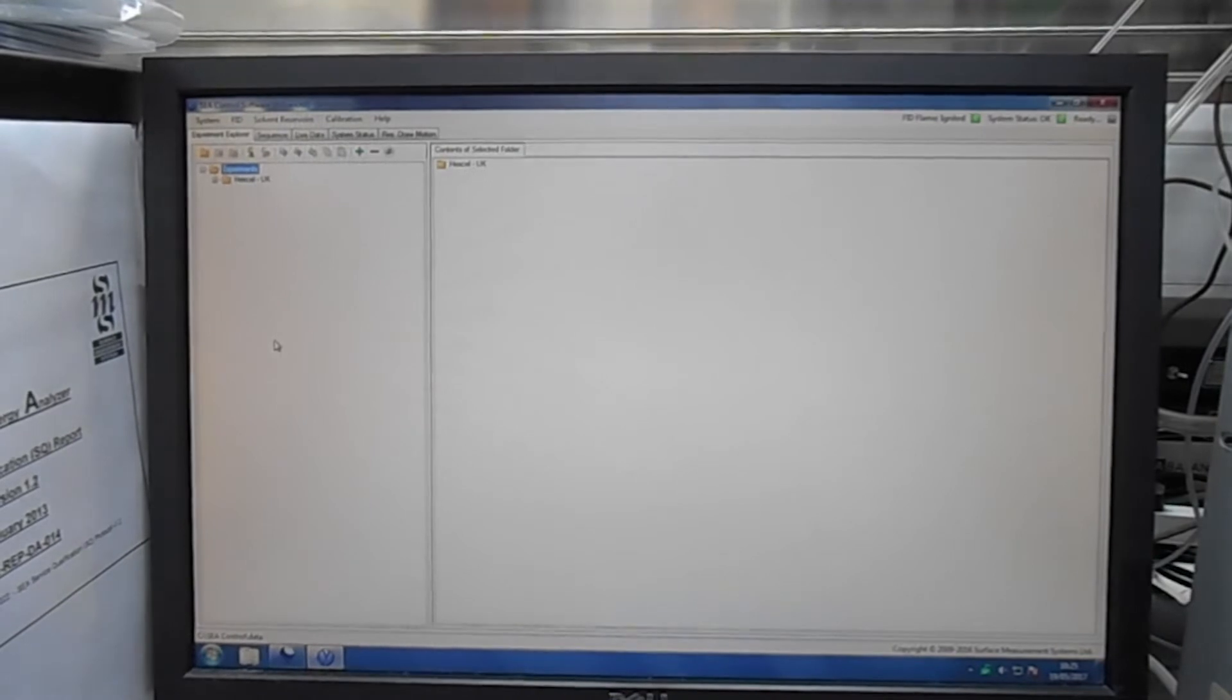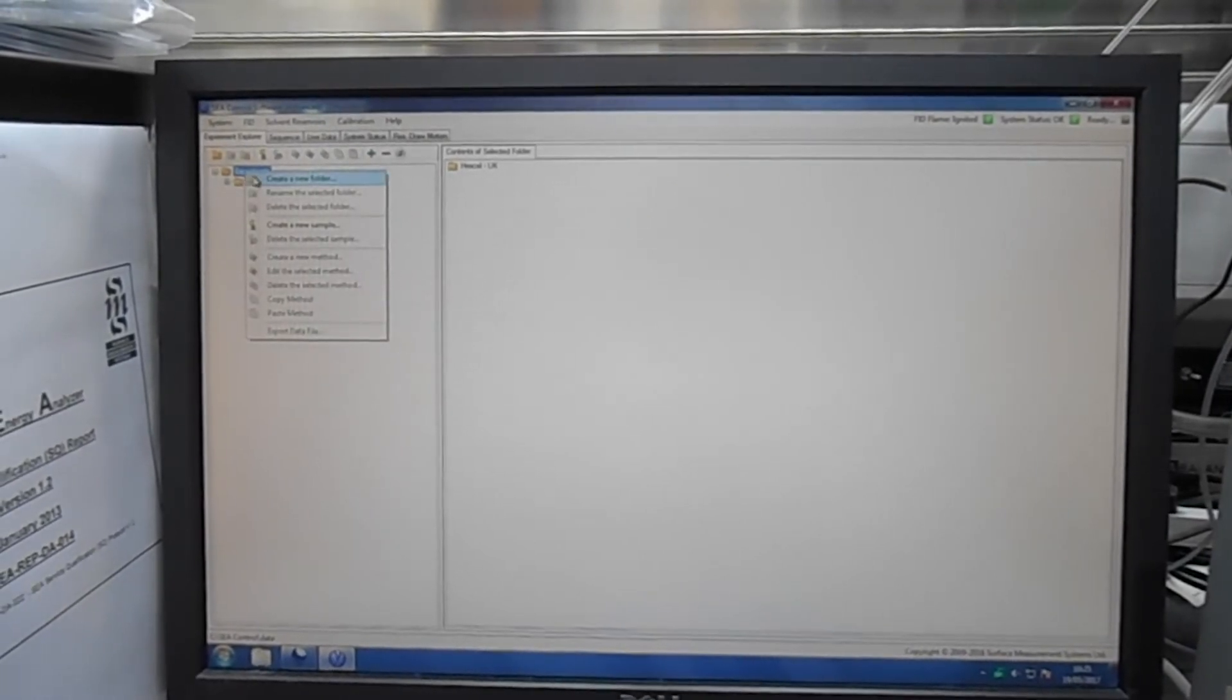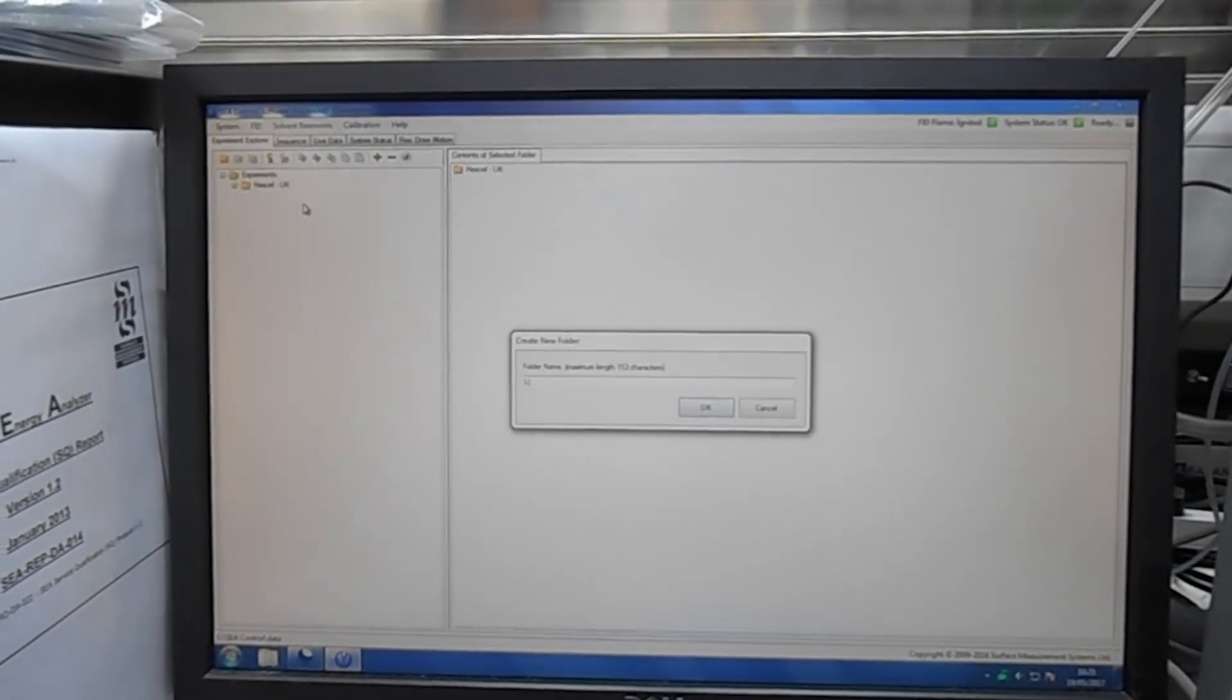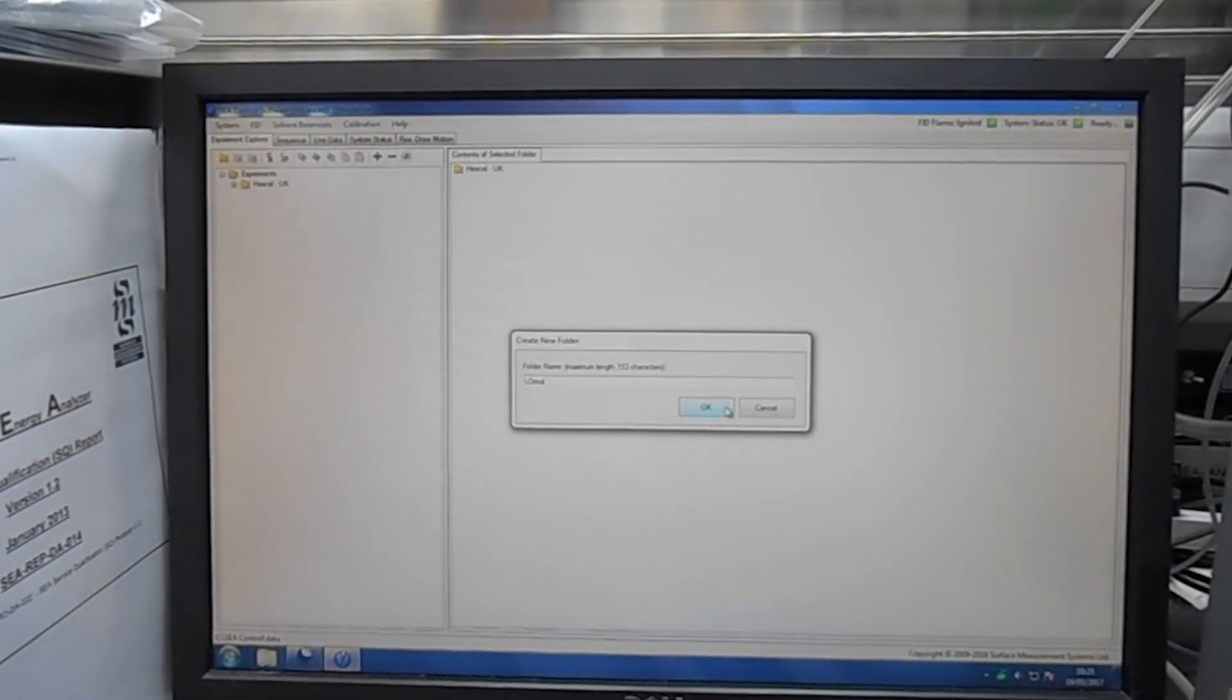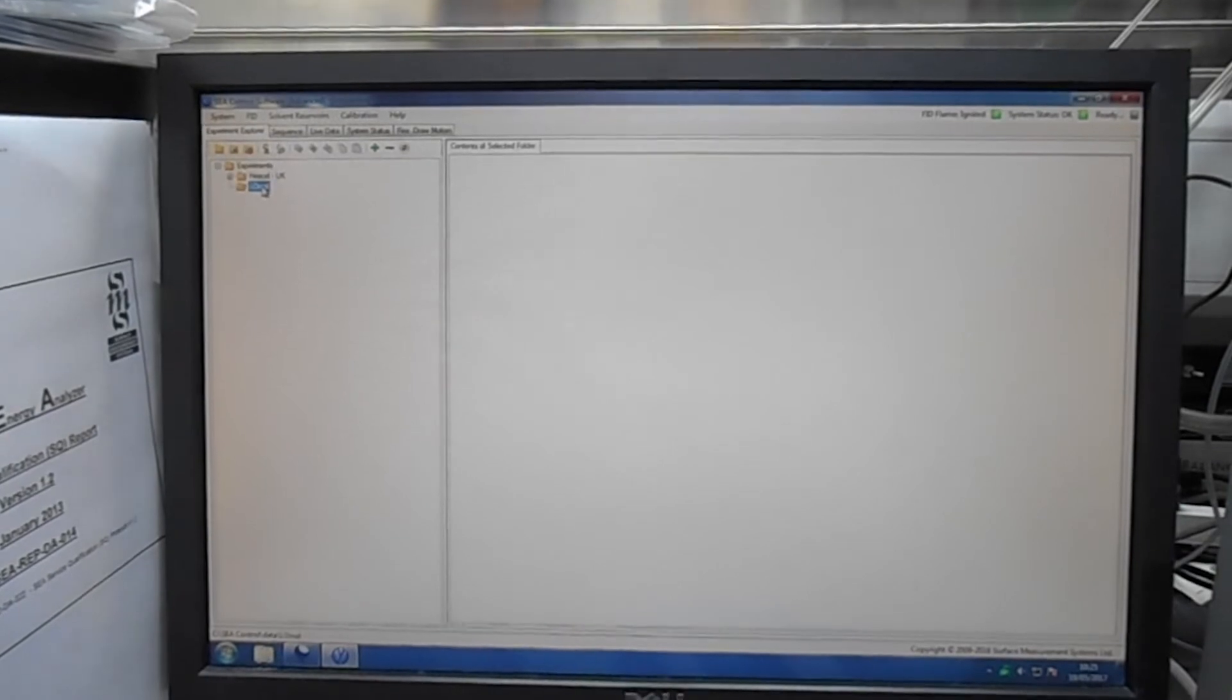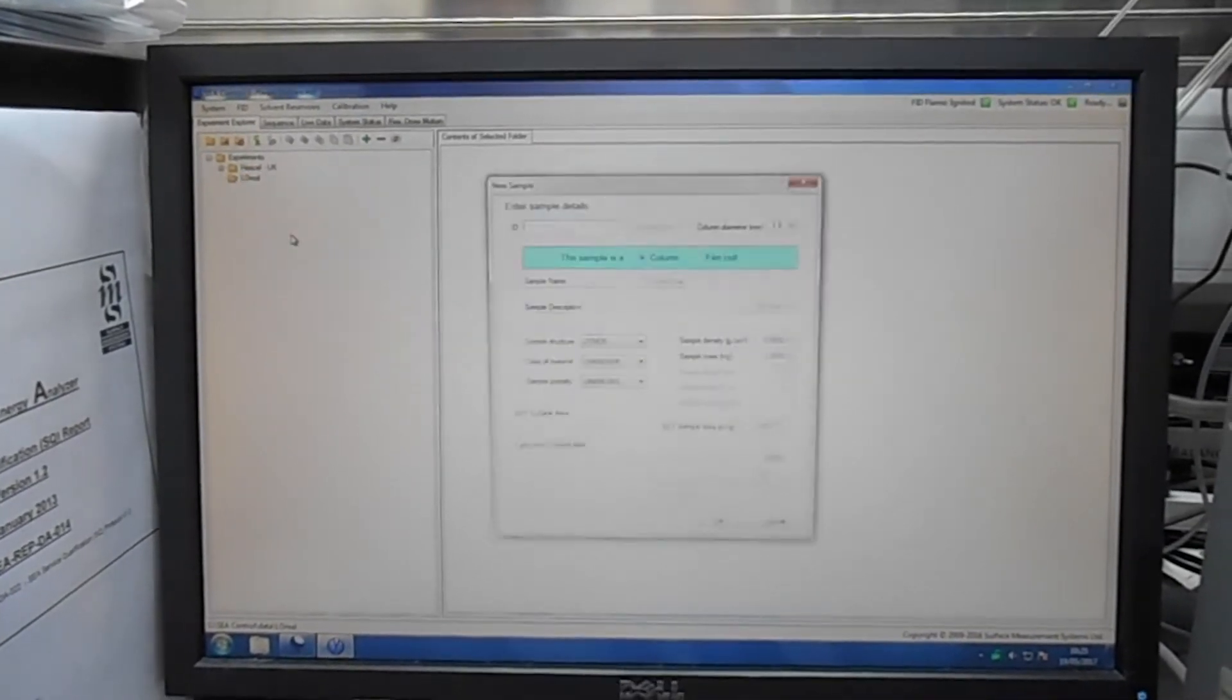After loading the column we can now go to the software and generate an ID for the column loaded. So here I am creating a folder for this project that will contain all the information about the sample.